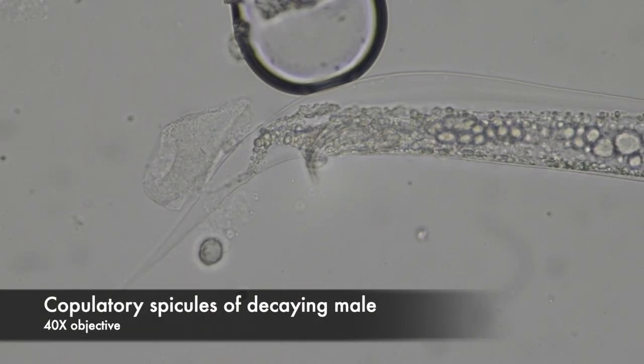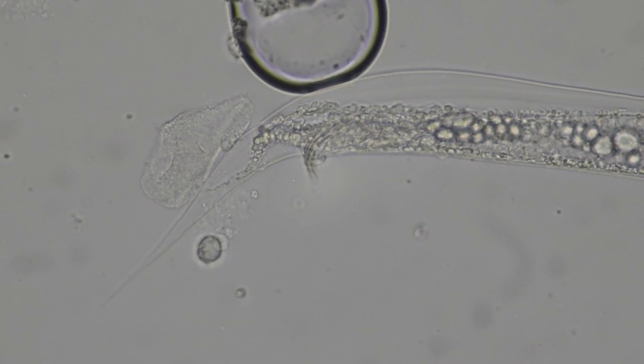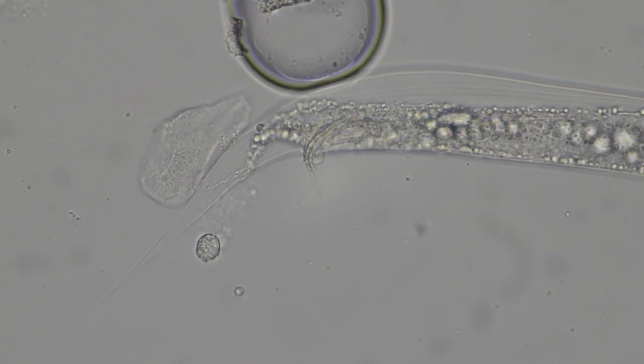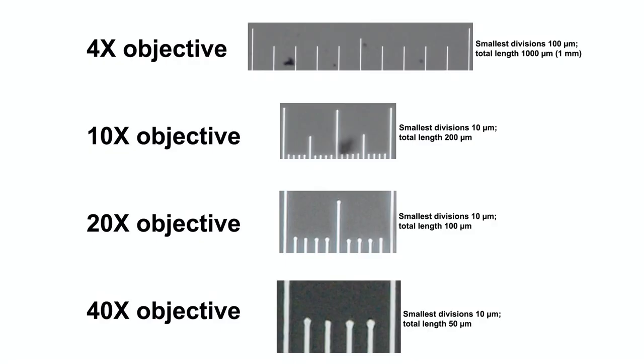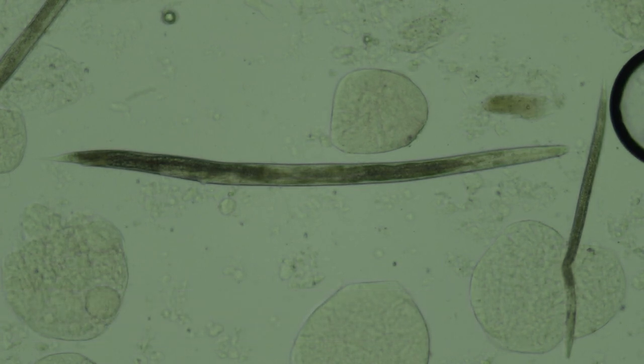Here's a dead individual whose copulatory spicules are sticking out a little bit and are particularly easy to see. Females don't have that hook in the posterior end, and they also have separate openings for the anus and the gonopore.